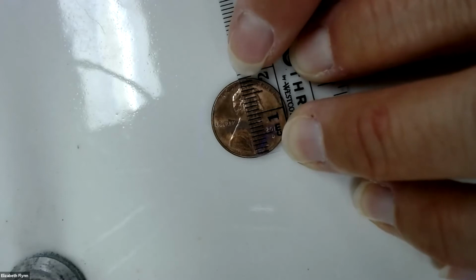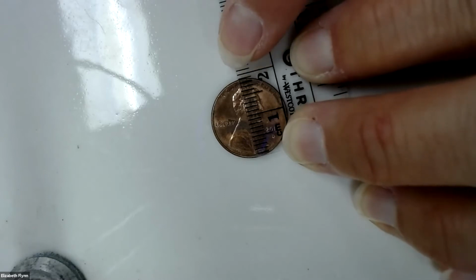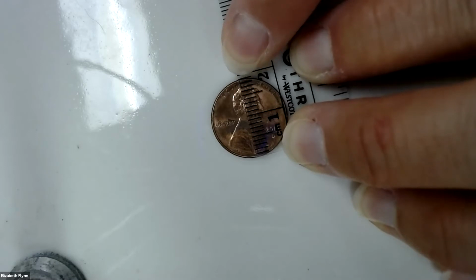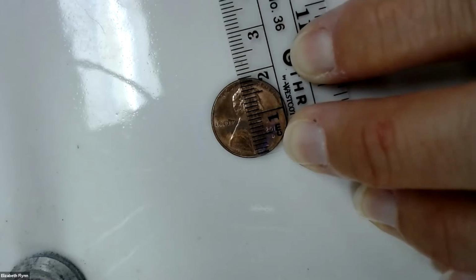See what I mean? The edge of the penny is just before the line. And so see how precise you have to be? You can't just say, oh yeah, that's 2 centimeters. No, no, no. We have to look really carefully and be really precise with our measurements. That end of the penny to me is just before the 1.9 line, so I'm going to write 1.89 centimeters for my diameter of the penny.